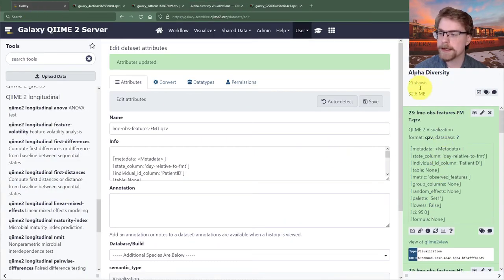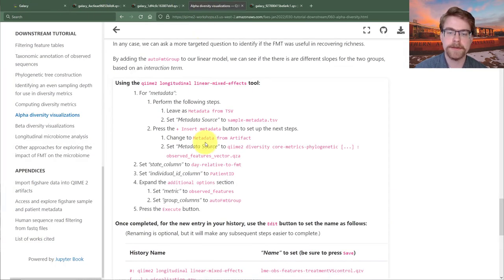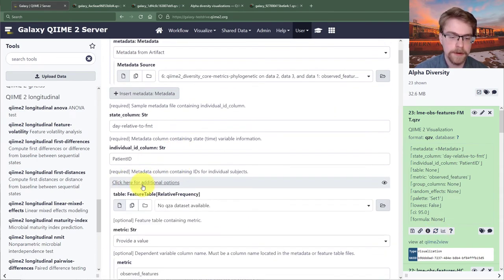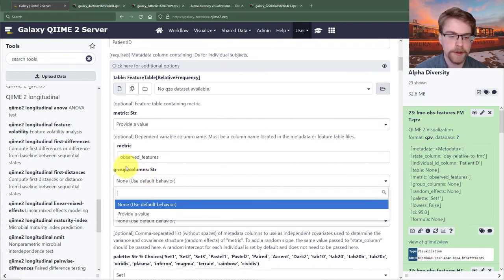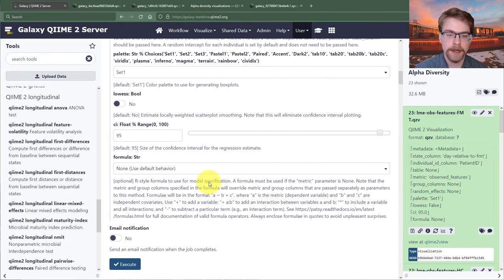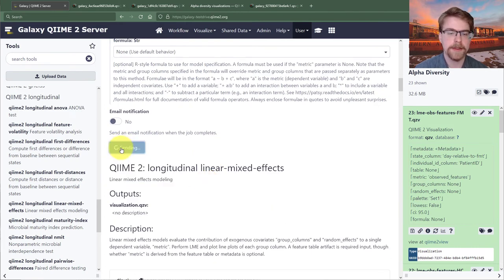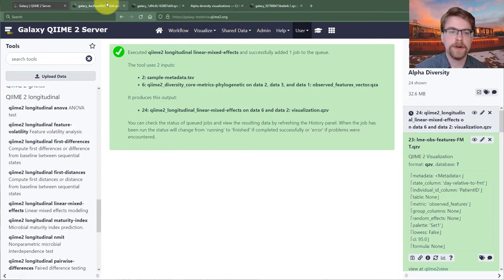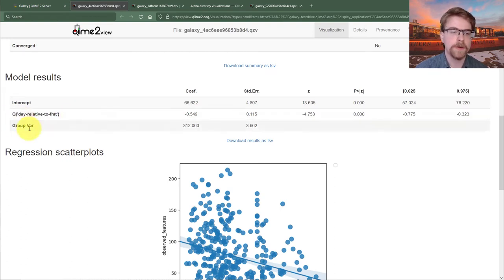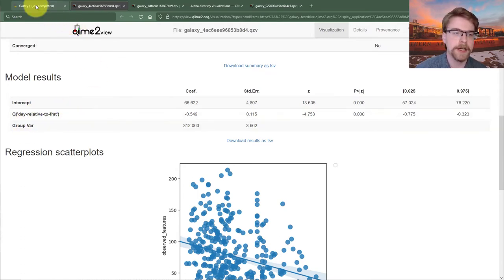Going back to Galaxy, I'll take the latest FMT result and press rerun. I'll provide a group column value of 'auto FMT group'. That's really the only change, so I'll execute that. What the group column does is expand the formula to be interested not only in day relative to FMT but also which group you're in, and whether the group matters with respect to day relative to FMT — an interaction term. The job has just completed.